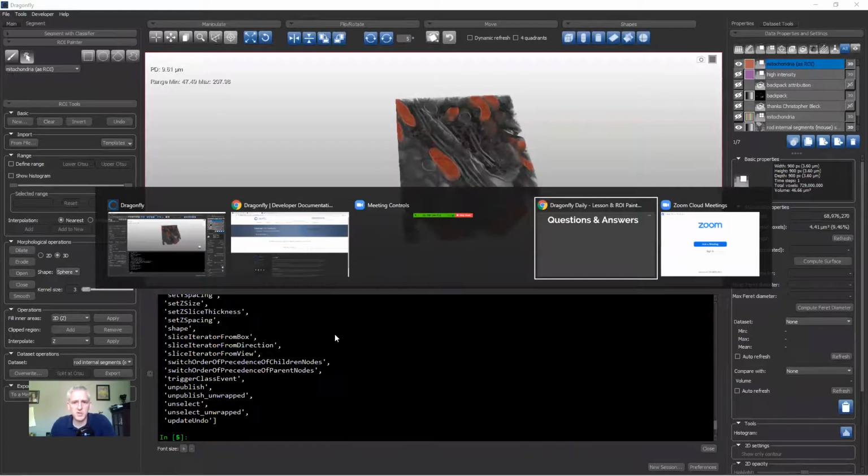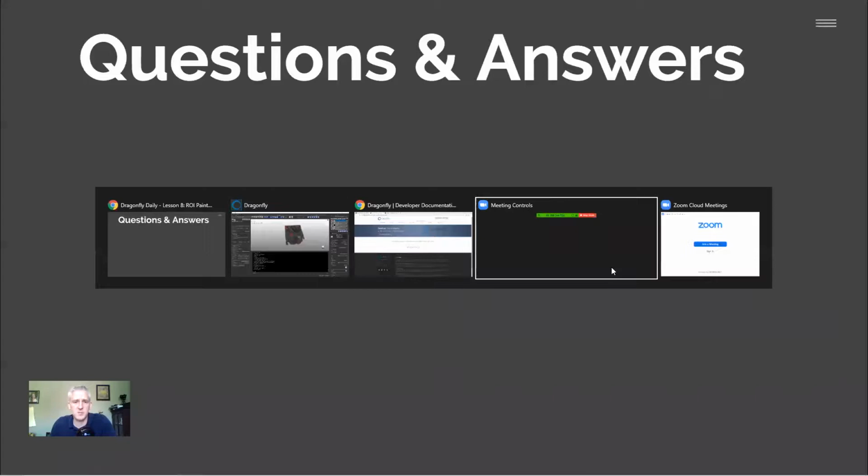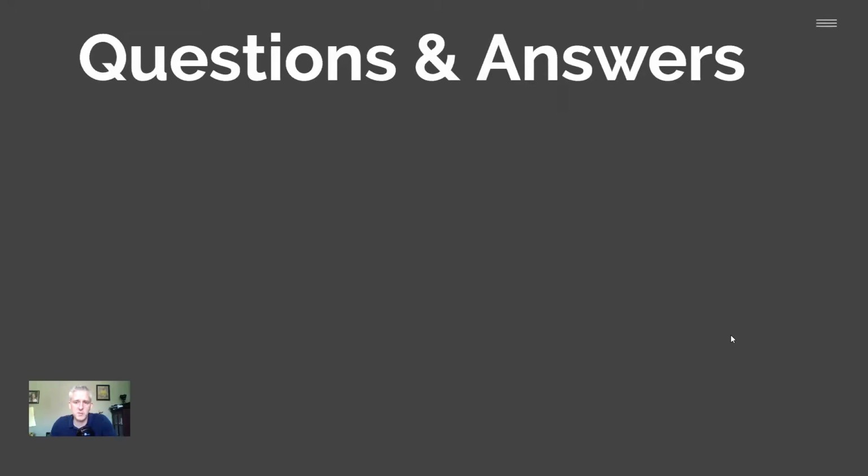So long answer, but there are tons of things you can do in Python with Dragonfly. Currently, we do not have any tutorials planned on that. We could spend a couple of weeks just teaching how to do things in Python with Dragonfly.